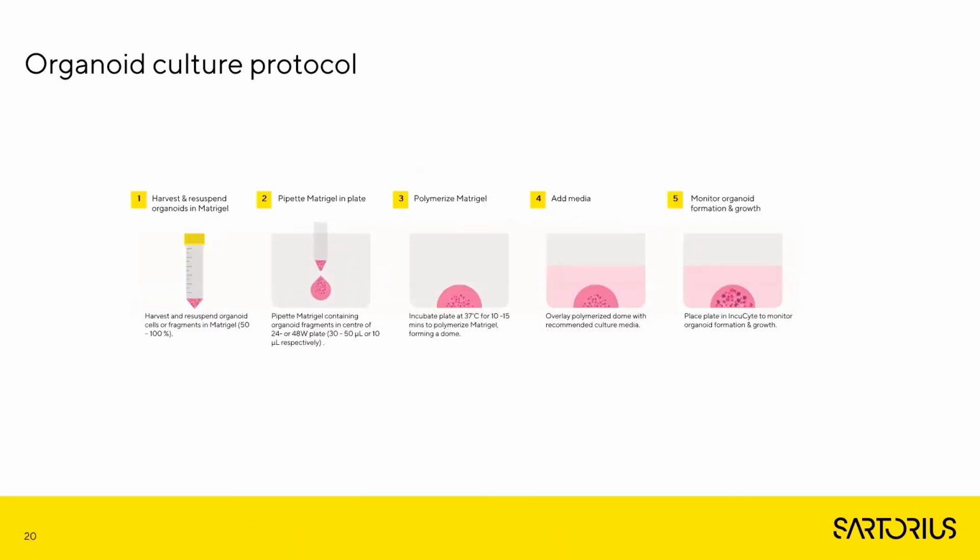So the remaining section of this webinar focuses on a 3D organoid model where organoids are embedded within Matrigel domes. This schematic shows how cultures can be prepared in either 24 or 48 well microtiter plates with organoids, as I said, embedded in these domes.